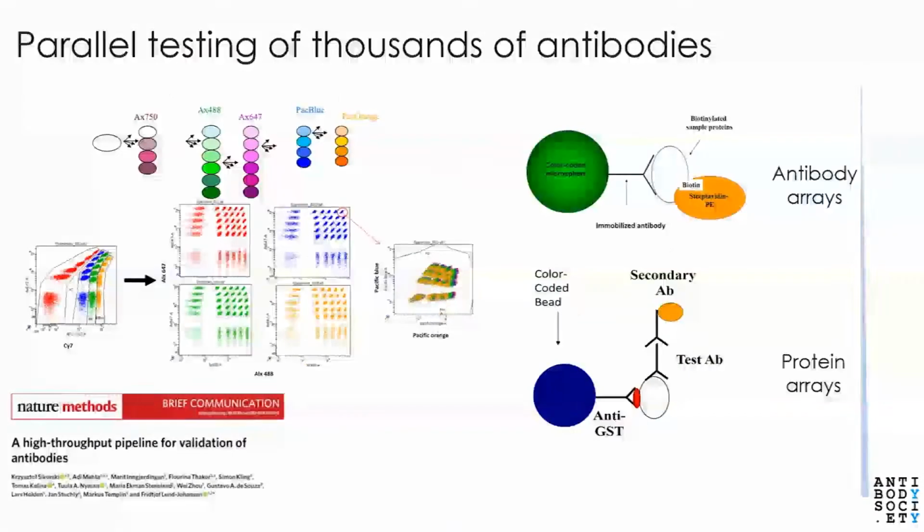In our laboratory, we have developed technology to deal with just this. We have developed array technology so that we can work with thousands of antibodies in parallel. Our arrays consist of latex beads with fluorescent barcodes. We can make as many as 4,600 different beads using 2 sizes and 5 fluorescent dyes, so we can work with thousands of antibodies in parallel.